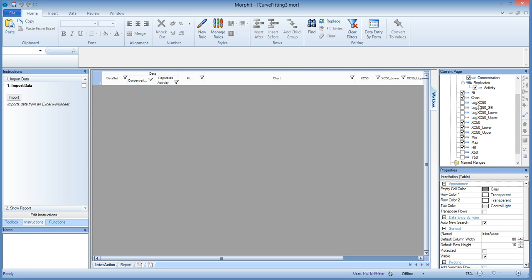And also what I did was I renamed all the EC50s, so both in the formulas and in the field names, to XC50. And the reason for that is that it is not always excitatory data in biology that we will feed into this binder. It can also be an inhibitory assay. So then we are interested not in EC50s but in IC50s. And it's basically using the same equation in the binder. So this is now a full multi-purpose binder.